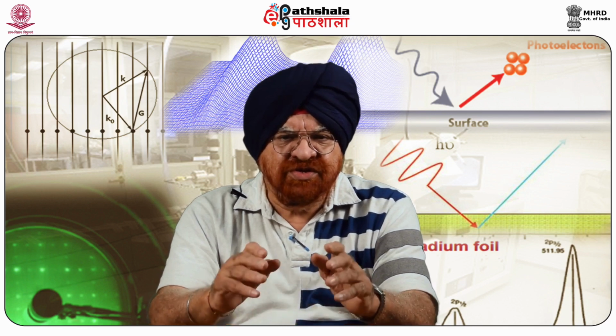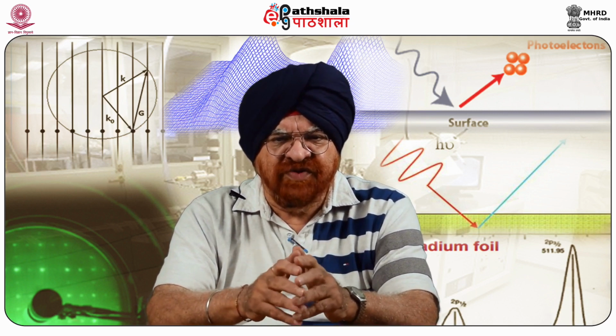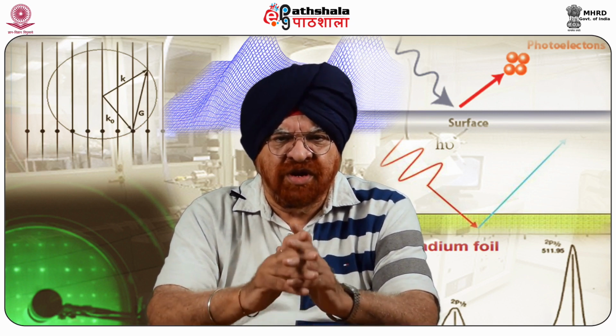For example, software packages like the Cornell Spectrum Imager, or as we call it CSI, provide an open source platform for intuitive, advanced approaches to the data analysis and processing of spectral images. It also includes the background estimation and PCA algorithms discussed in this particular module, as well as a graphical interface for the principal component analysis.